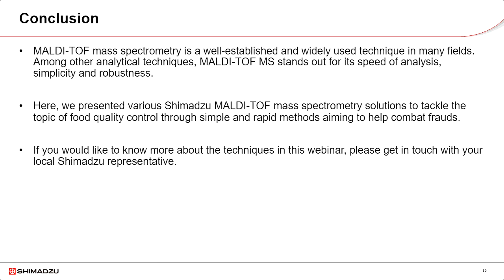In conclusion, MALDI-TOF mass spectrometry is a well-established and widely used technique in various fields. Compared to other analytical techniques, it stands out for its speed of analysis, simplicity, and robustness. In this webinar, we presented various MALDI-TOF applications for food analysis, in which simple and rapid methods aiming at combating the problem of food fraud were developed.